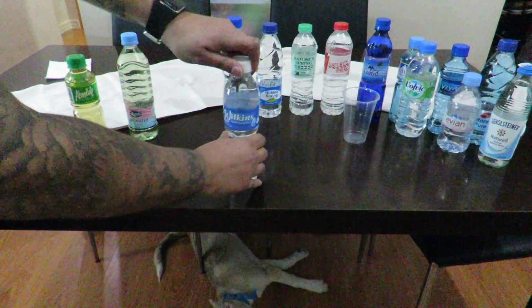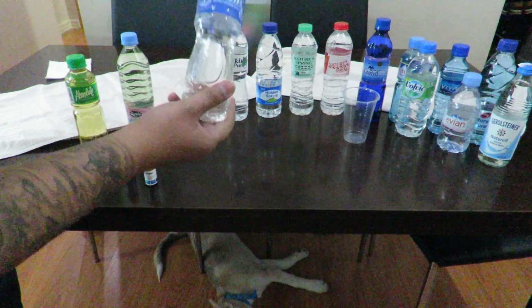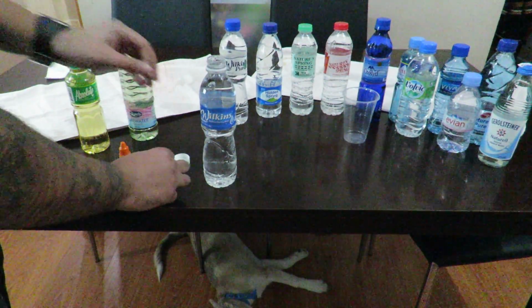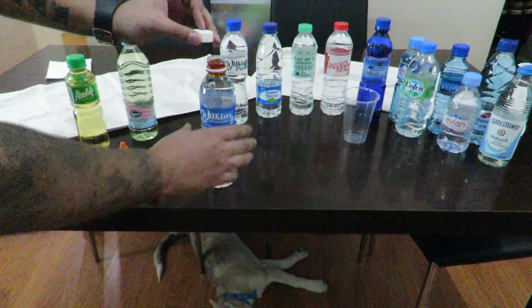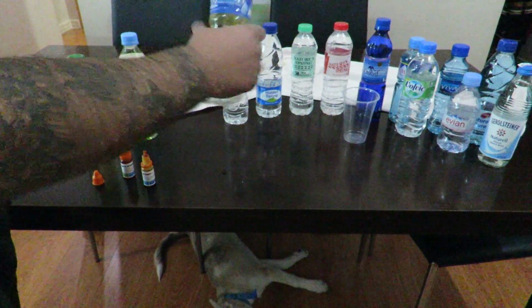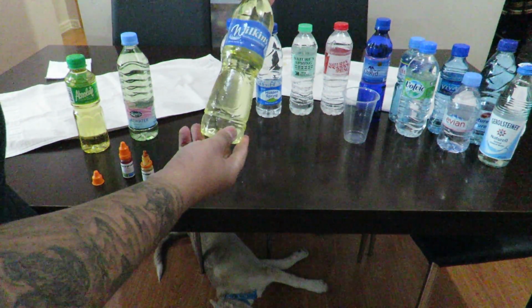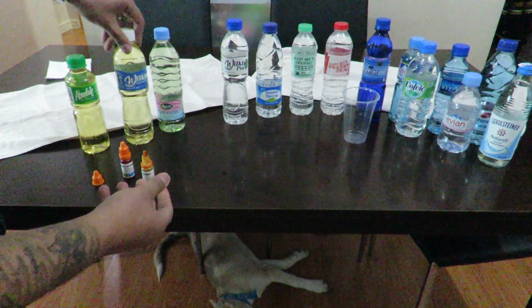And then we'll go with Wilkins. Wilkins is very famous over here. Wilkins is everywhere in the Philippines. And this one here is Distilled, and this one here is Purified. So we'll start with the Distilled. We put lots in so we don't make a mistake, and we get very good colors. And give it a shake. So that didn't really turn out too well. That's pretty orange, but not as orange as Absolute. So we'll put it in the middle right here.